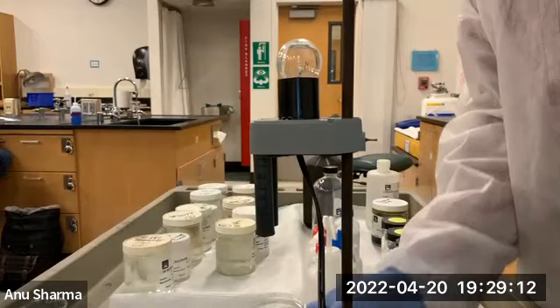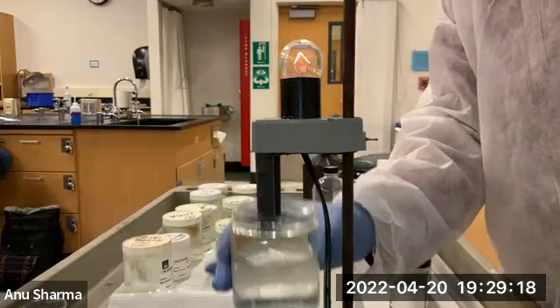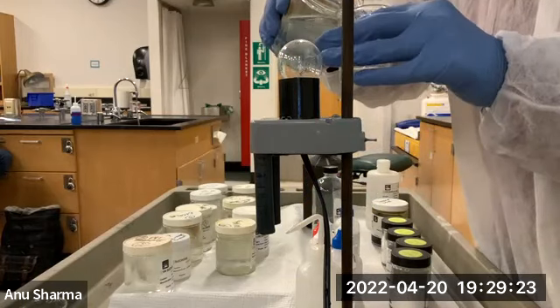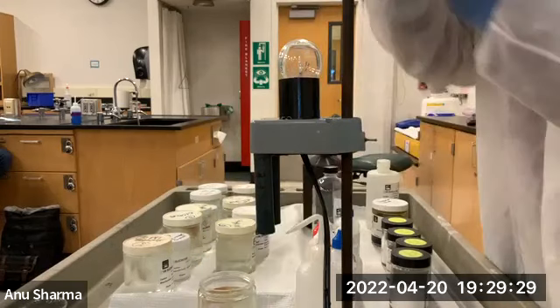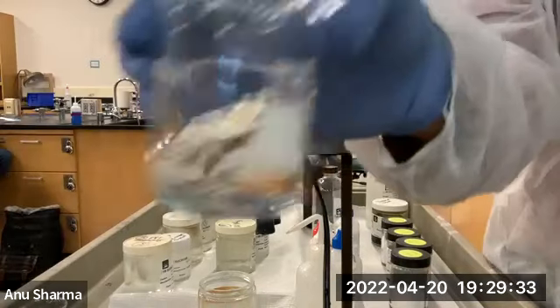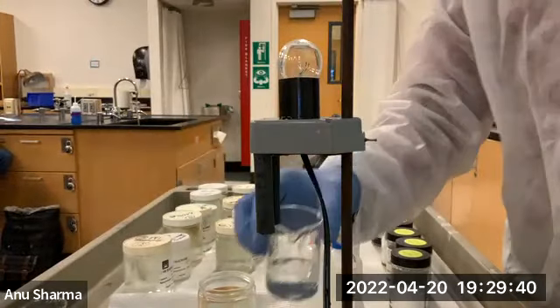Okay, here we have very weak, right? Both of them are weak. Now mixing the acetic acid with ammonia, and it should give you ammonium acetate. Okay, so I mixed it, ammonia and acetic acid mixed together, and they should give you a reaction.